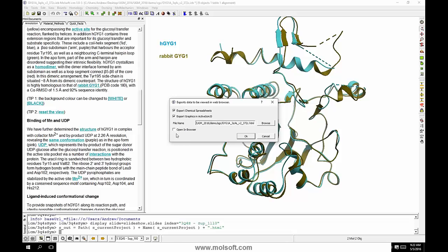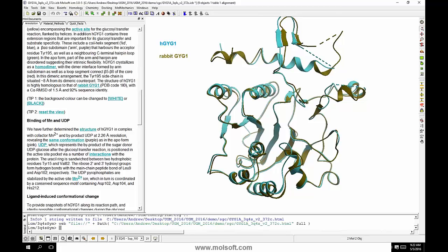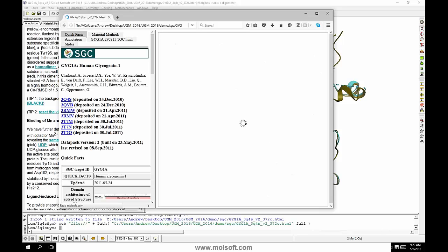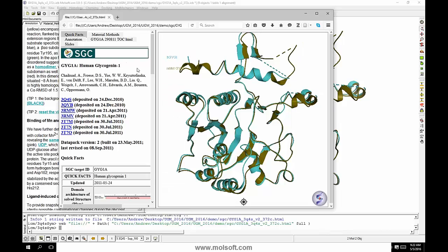and then you toggle this. Basically, on my slide it calls WebGL, but now it's more familiar: it's ActiveIcmJS, and you can also show it in a browser. So it launches Firefox, which will hopefully open our page. Yes, it does.